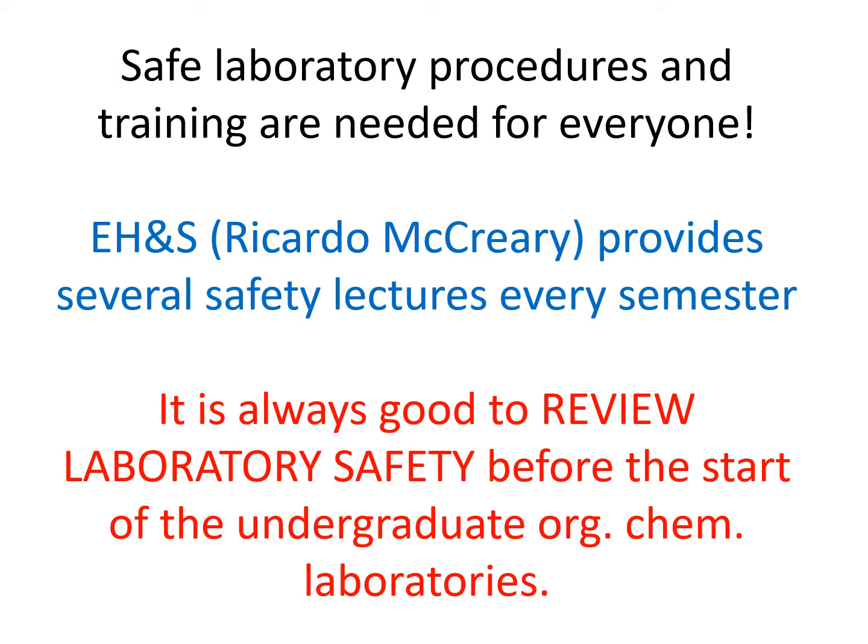All right, safety laboratory procedures and training are needed for everyone, not just you, but for the grad students, the TAs, such as myself, and the professors. We have to retake them every year. Ricardo McCreary is our point of contact with environmental health and safety, and he will provide several safety lectures every semester. For those of you that are going to go into lab sciences, you'll definitely be seeing him at some point, or at least someone from environmental health and safety. And every semester, and as a matter of fact, I suggest before every lab, not just because you're going to be quizzed on it, it's always good to review laboratory safety sheets for all chemicals and any procedures you're doing, because it's very important that everyone stays safe and healthy, especially with things going on as they are now.